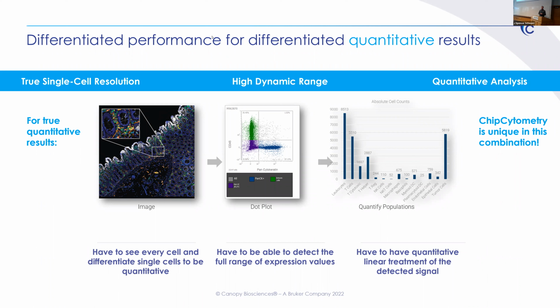But we know these things, and we have the internal training as well as the technical help to walk you through it. Generally, if we're looking for proof positive that we have an assay and we're happy with it, we'll run that assay forwards as well as backwards and look for differences in the expression values. Usually, if there's a major issue, you'll catch it there. The other thing that's cool about doing it cyclically is that at every one of those rounds, if you catch one of those issues, you can look at it then and there, as opposed to trying to decipher that from 39 other markers if it's a 40 marker panel. So that's how we tend to approach it.